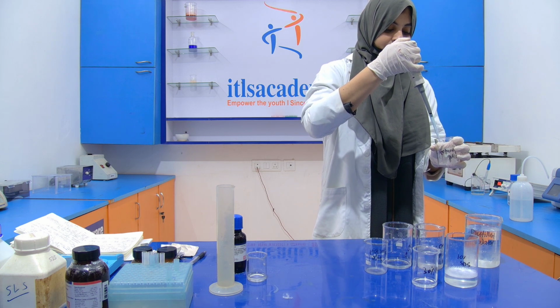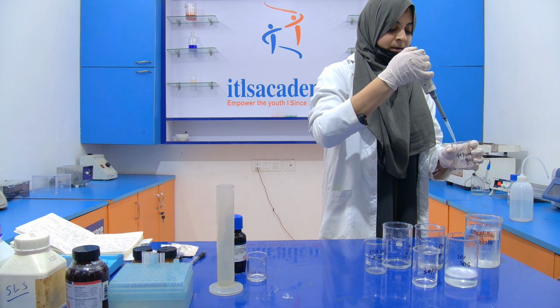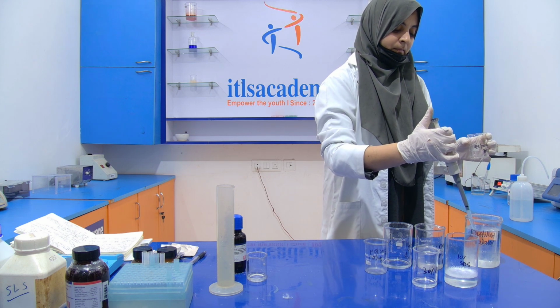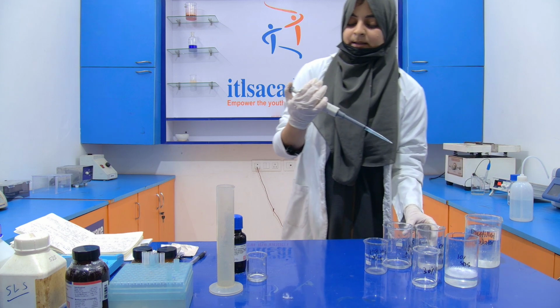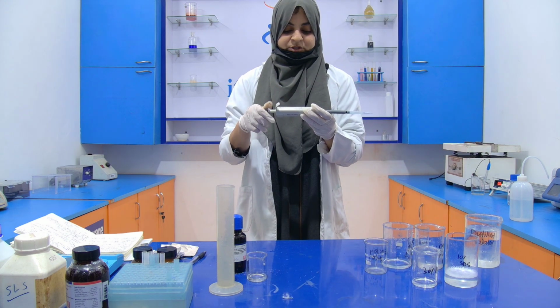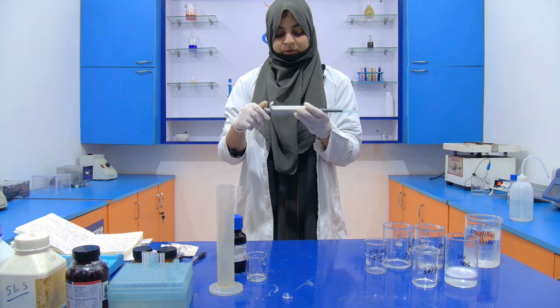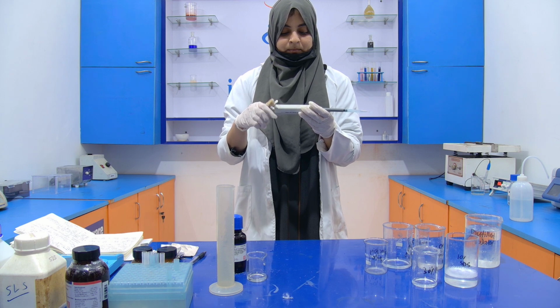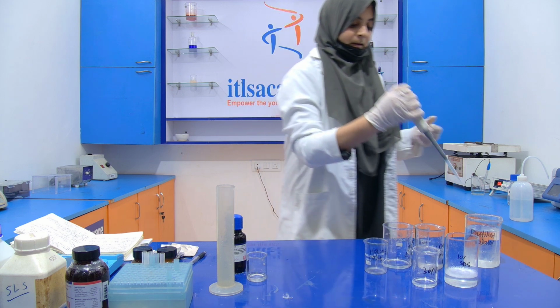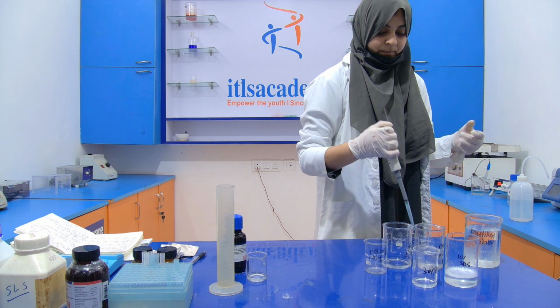1 ml, 2 ml, 3 ml. Then, with the help of this, we add 200 microliter with 3.2 ml.